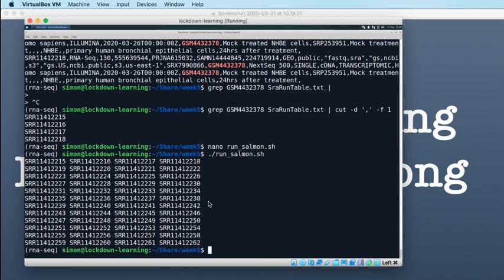Now this is where it gets a little bit trickier. We've seen a way of editing things like this before, using sed, the stream editor. And that's what we're going to use here. We're going to use sed. The way that I'm going to do this is slightly convoluted, but it was the simplest way that I could come up with without doing a lot of awful, barbaric syntax.